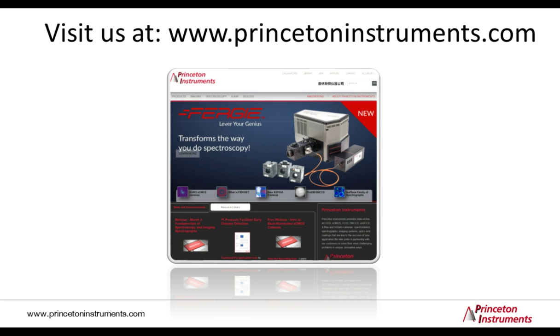One aspect that's important is the various strategies to increase it. One strategy might be to go to higher laser energies. The Raman cross-section typically goes with the frequency to the power of 4, so the higher the frequency, the more light you produce. But nevertheless, it would be very weak. Just to put this in relation, I said like 10 to the power of 10. On a typical 16-bit CCD, the dynamic range goes to 65,000 counts. So yeah, the laser would be pretty overwhelming.